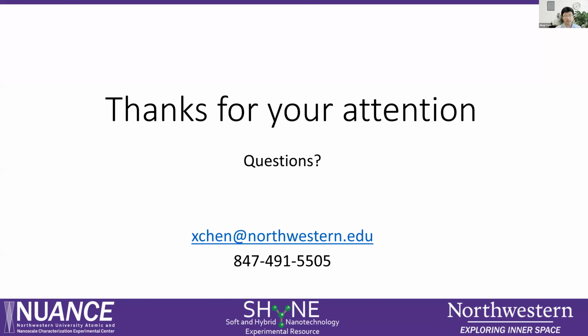Okay, so that is my presentation and talk about the basic principle of the ToF SIMS, and hope you can get idea, understand what is ToF SIMS can do, cannot do, and in the future you have a sample, you can wisely choose, and from XPS, ToF SIMS, EDX, or anytime. And after this, even during the presentation or after that, anytime you can talk to me, and you have this project, so which method you should choose. Okay.